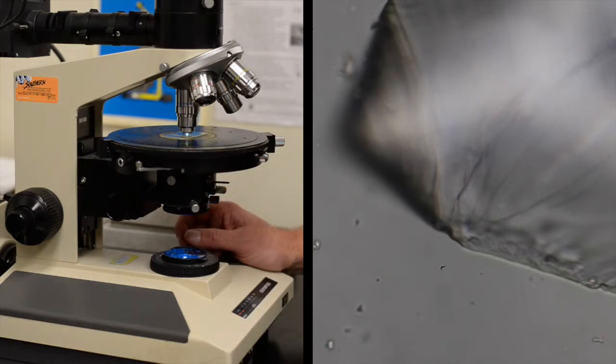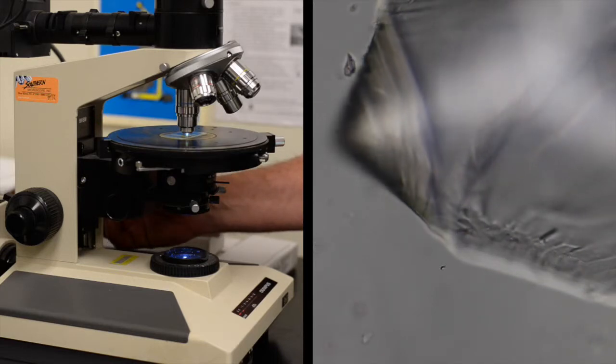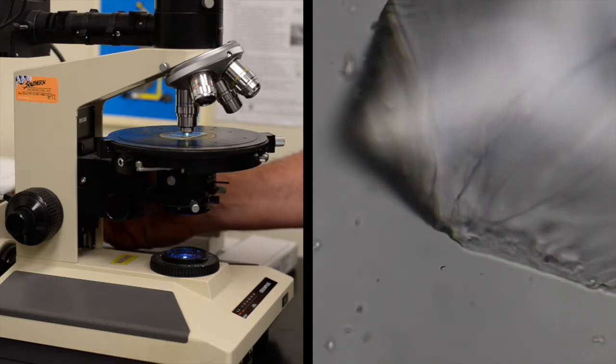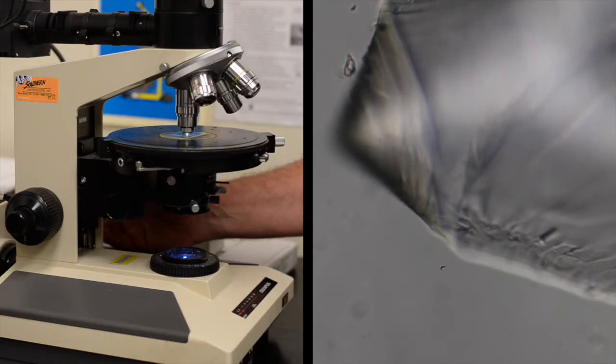Now the way to do the test is to lower the stage, increasing the distance between your eye and whatever you're looking at. And you will see when I do this a halo form. In this case it's going to move out of the mineral into the epoxy as I lower the stage. And the principle here is that the halo moves into the substance with the higher index of refraction.